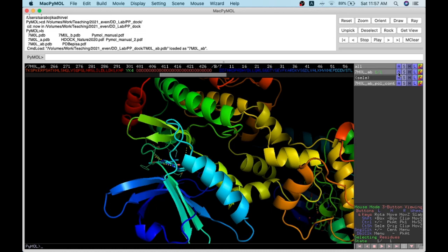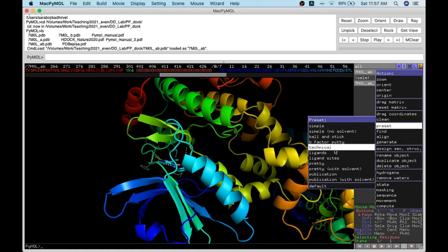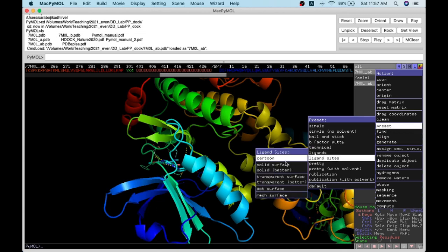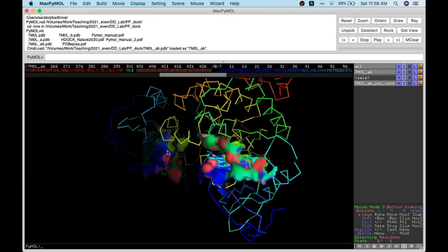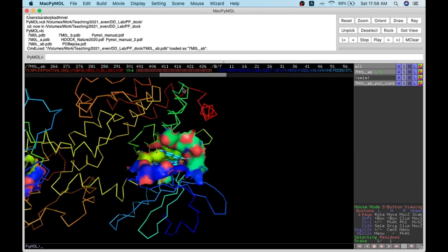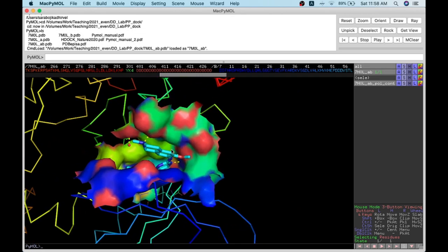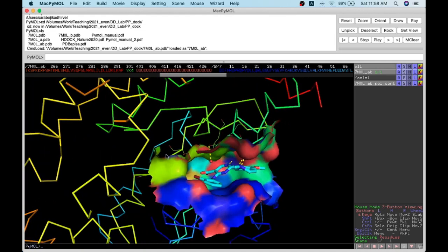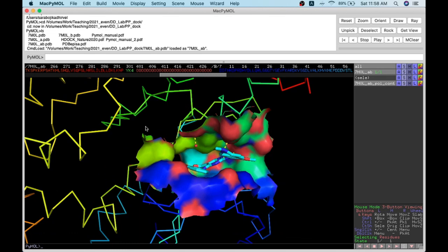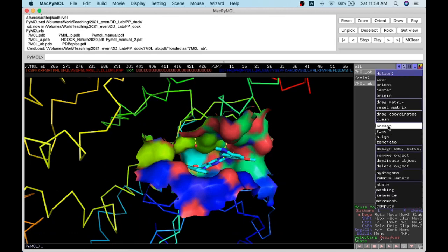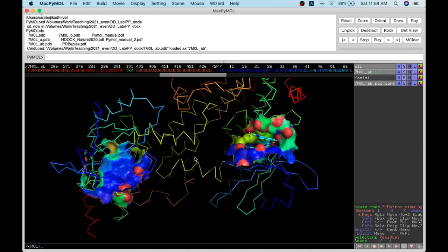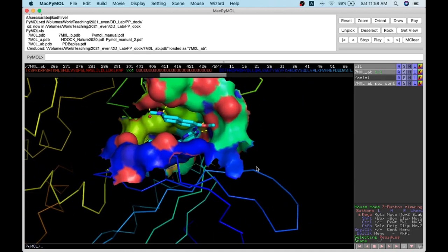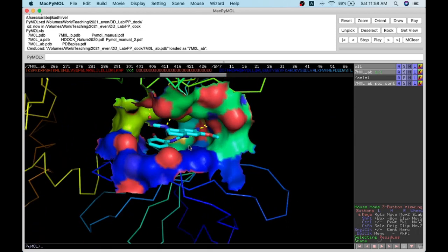You can use presets as a starting point and refine the process to make beautiful diagrams. Other preset options include 'ligand site solid surface,' which shows a surface view around the ligand with the backbone in ribbon diagram and the ligand in sticks representation. The 'ligand sites solid better' option covers a larger area and shows the residues with connolly surfaces, giving a better orientation. Various preset options in PyMOL provide quick and beautiful representations.